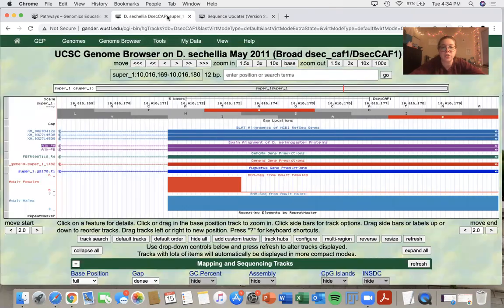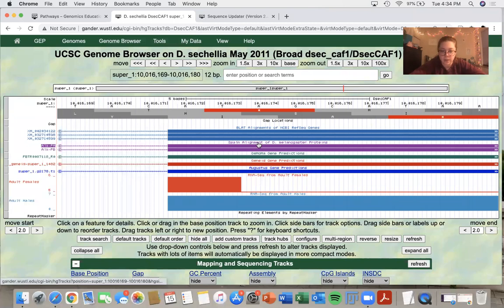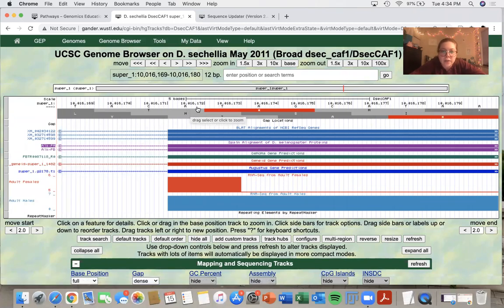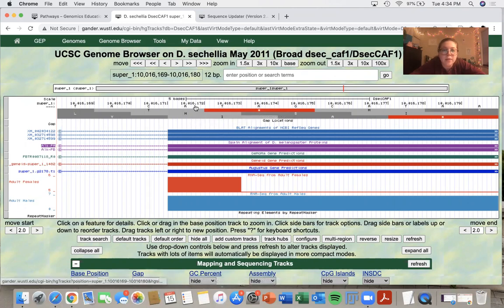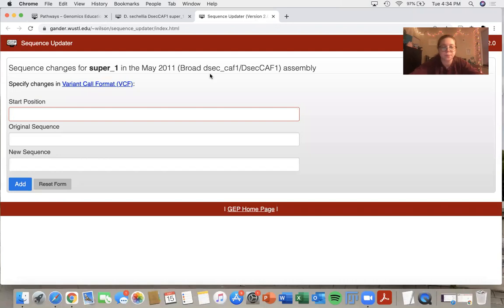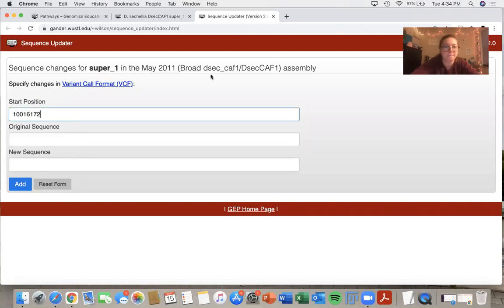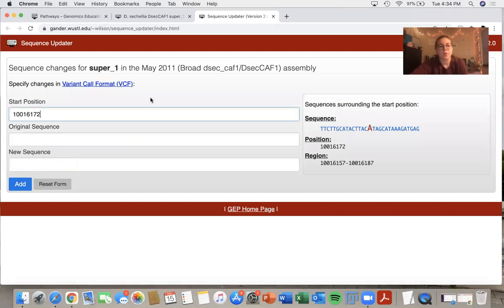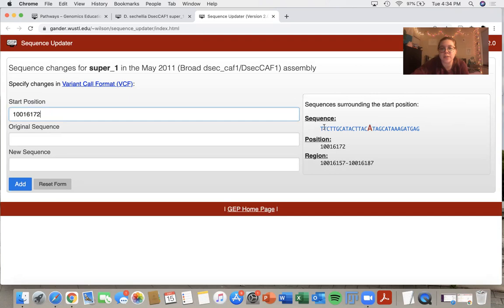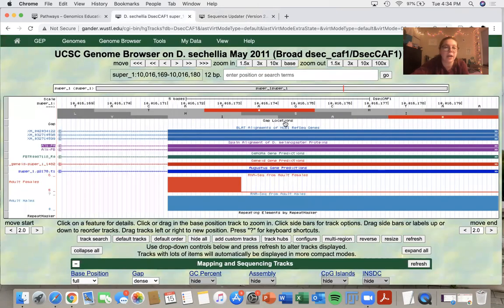If I navigate back to the genome browser, I can determine that the last three bases are these three. And the first base is 10,016,172. So when I type in my start position over here on the right, it'll show me what the sequence is at that particular place. So I can confirm on my sequence updater that I have the correct sequence that I'm looking at.